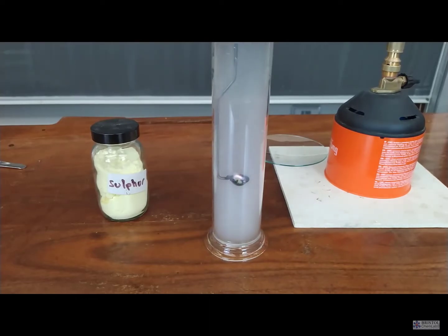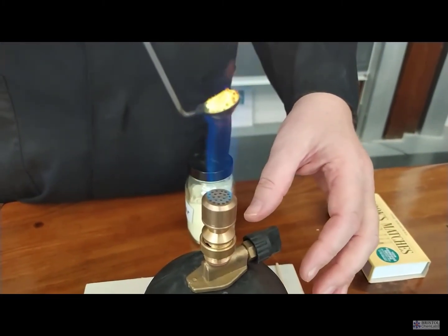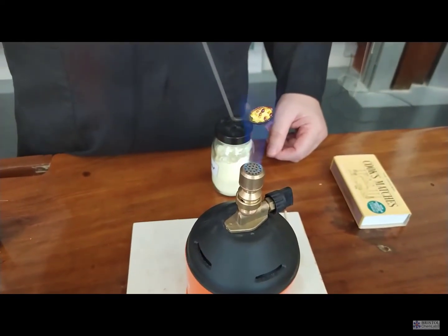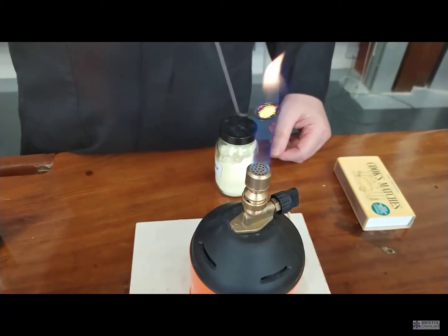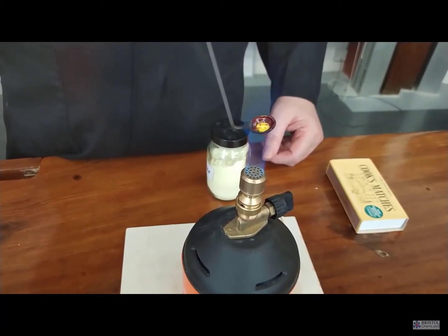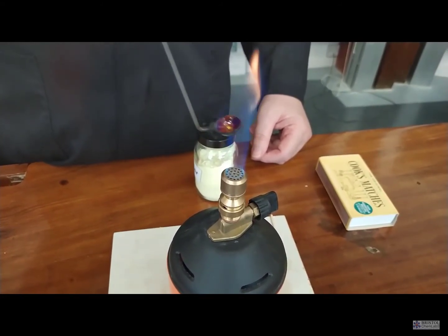Secondly, you don't want the spoon or the magnesium ribbon when it's alight coming into contact with the side of the gas jar because, as you'll see in this demonstration where we use too small a gas jar, it cracked because of the heat produced on combustion. The black coloration that you may see is a reaction between the hot magnesium and the silica in the glass.